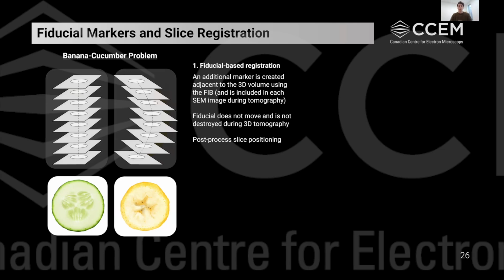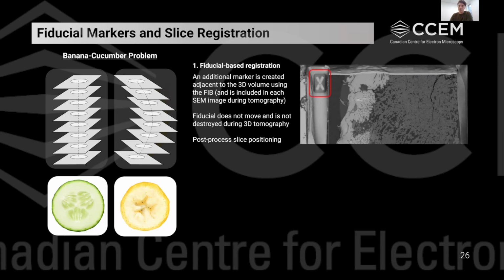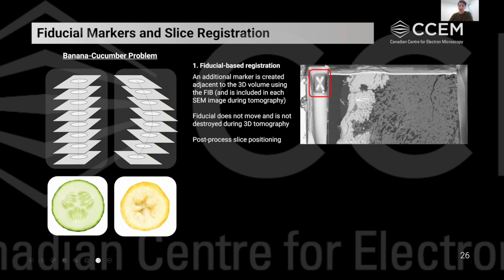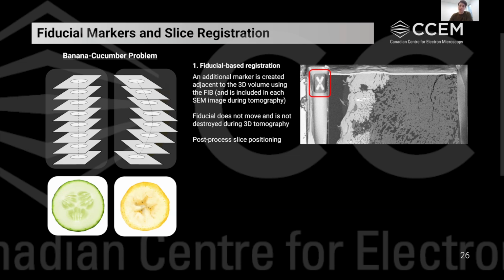If we want to do something called fiducial-based registration, and this is typically with volumes that are not rich in information in a single image, what we can do is add a marker right next to that tomography volume when we're preparing the site. In this case, I've added a small x in the case of this eggshell, for instance. And this is going to be in the exact same position, no matter which slice we're acquiring in that 3D volume.